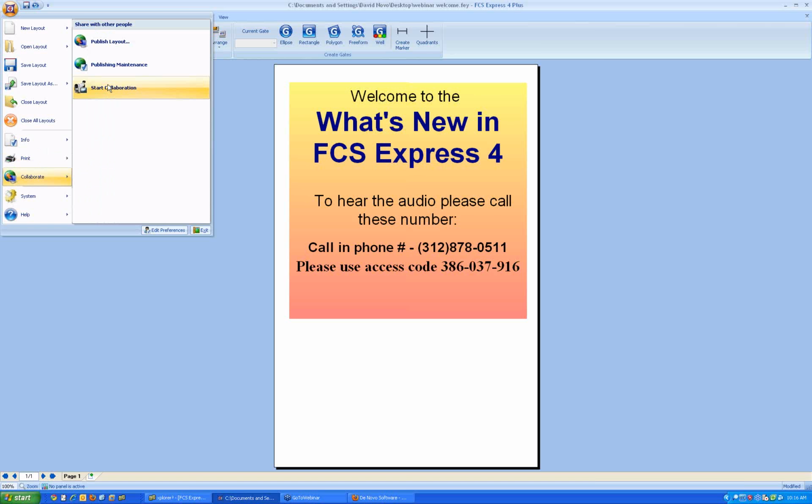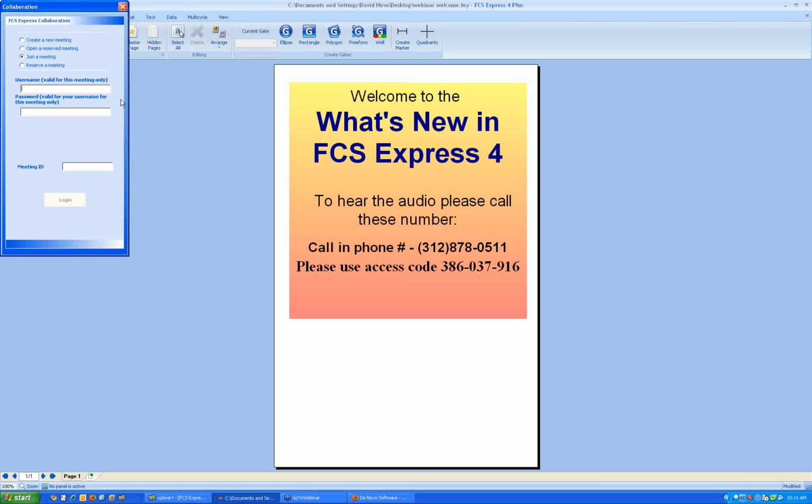You basically start the collaboration and you can create a new meeting, and when you create a new meeting, you get a meeting code, and you can give somebody the meeting code, and what they would do is join the meeting and type in the meeting ID here on the bottom. And when they type in the meeting ID and join your meeting, you can have as many people in a meeting as you like, of course, you can show your FCS Express desktop.